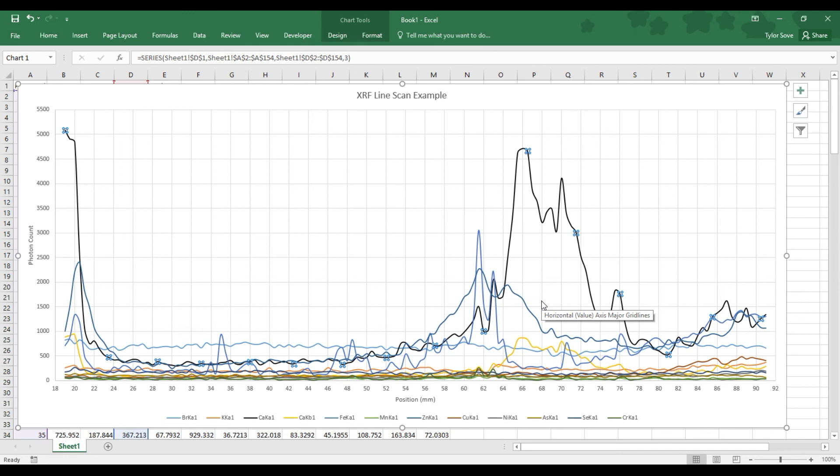So that's how you identify different features on an XRF line scan.